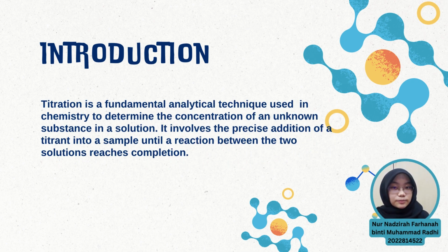What is titration? Titration is a fundamental analytical technique used extensively in chemistry to determine the concentration of an unknown substance in a solution. It involves the precise addition of a titrant, a solution of known concentration, into a sample until a reaction between the two solutions reaches completion.